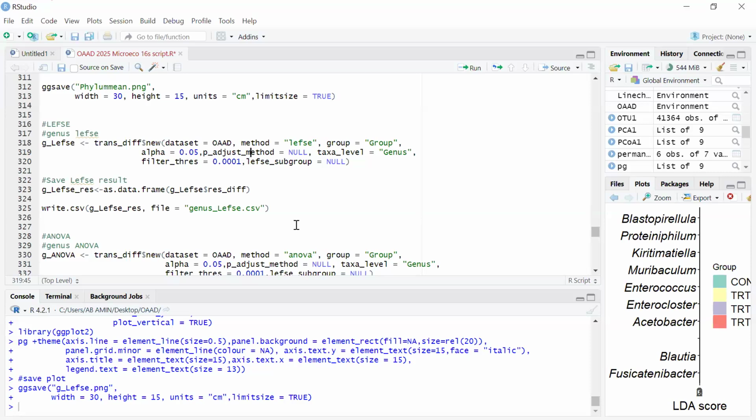Can I respond? Yes, sir. Okay. So what I usually do in such cases is you need to clean up your data. Well, cleaning up, I don't mean you should delete them.